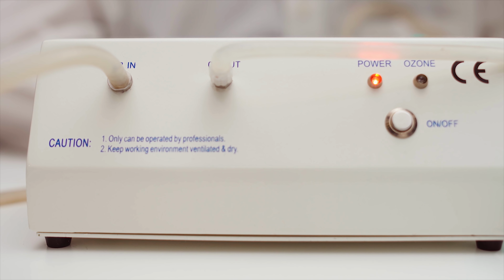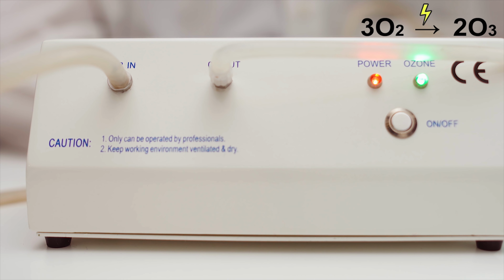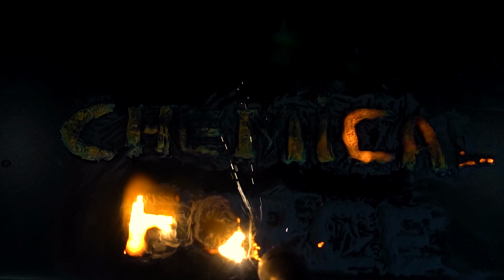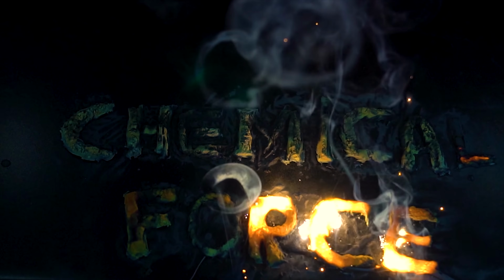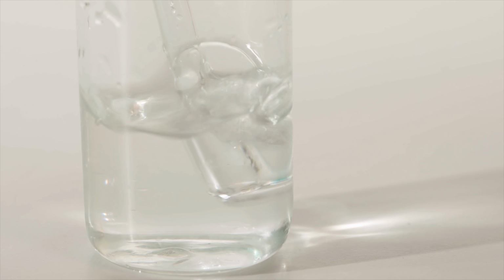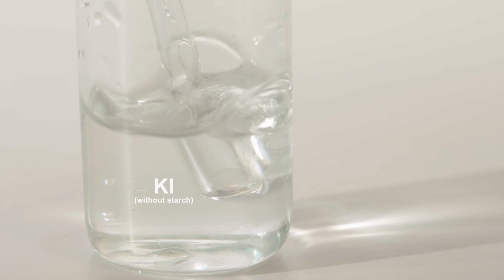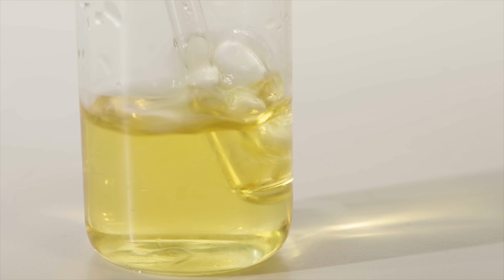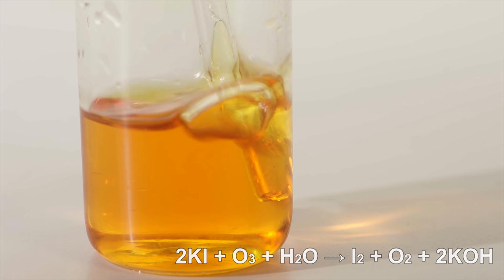Ozone is easily detected by smell, but YouTube doesn't carry over smells. So let's use chemical reactions to make sure we do have ozone forming. The reaction of ozone with potassium iodide solution and starch is the one that serves as a qualitative reaction to ozone. This reaction results in elemental iodine forming, and we can see the solution that is passed through ozone turn dark orange.